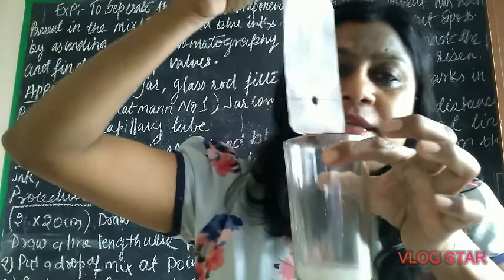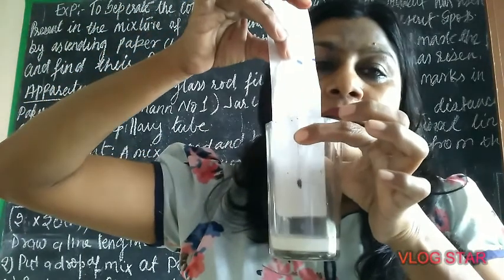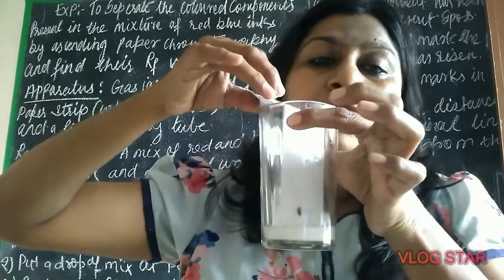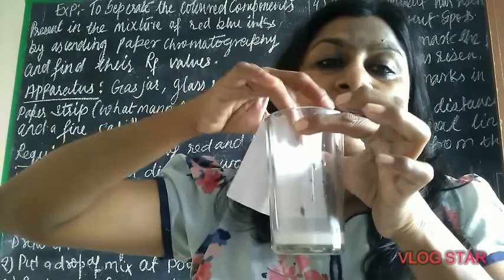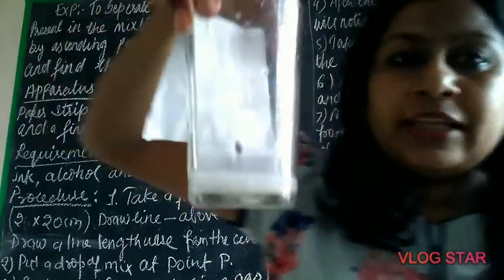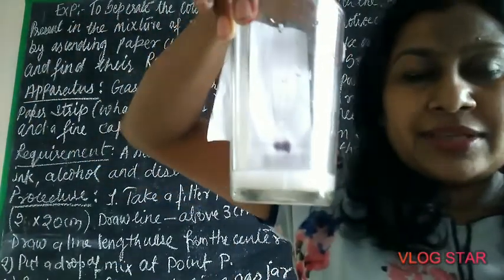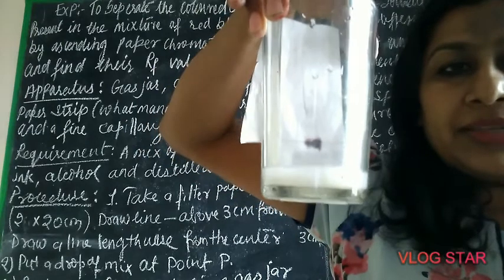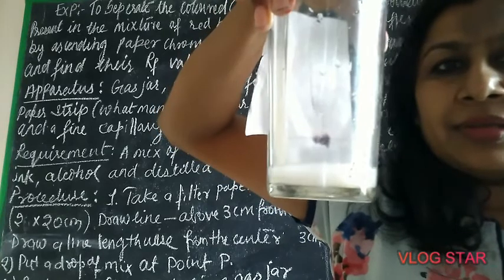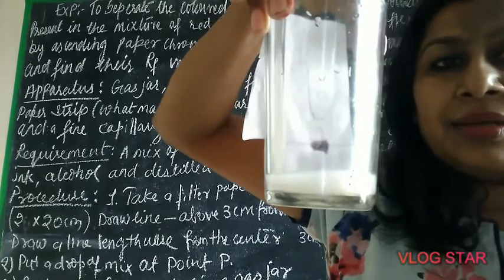Once the drop is dried, suspend the paper in such a way that the drop is above the solvent — it should not get inside the solvent. Gradually you will find the mixture is rising. See children, the solvent is rising — alcohol is rising up the paper.